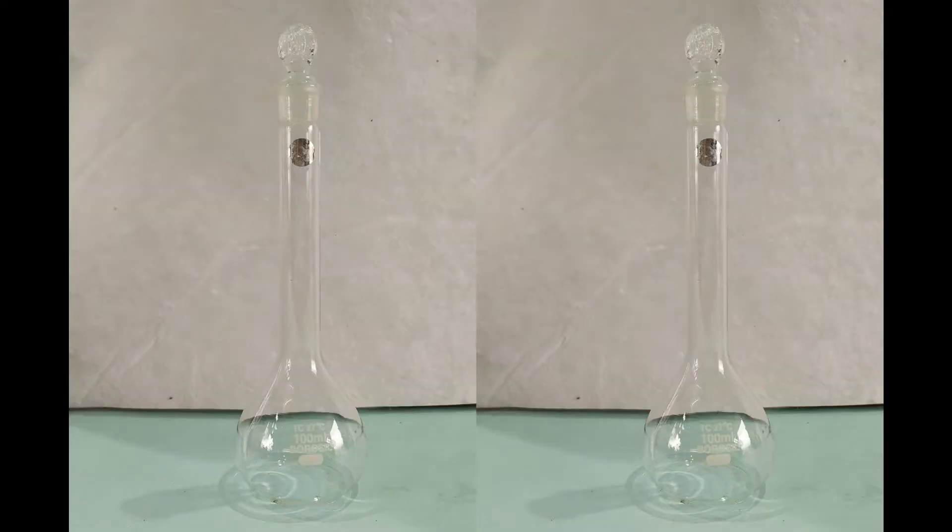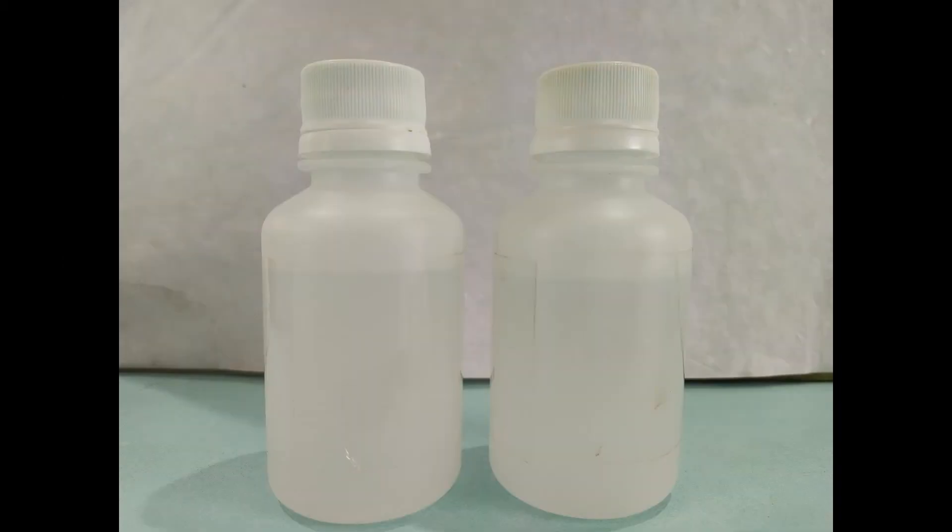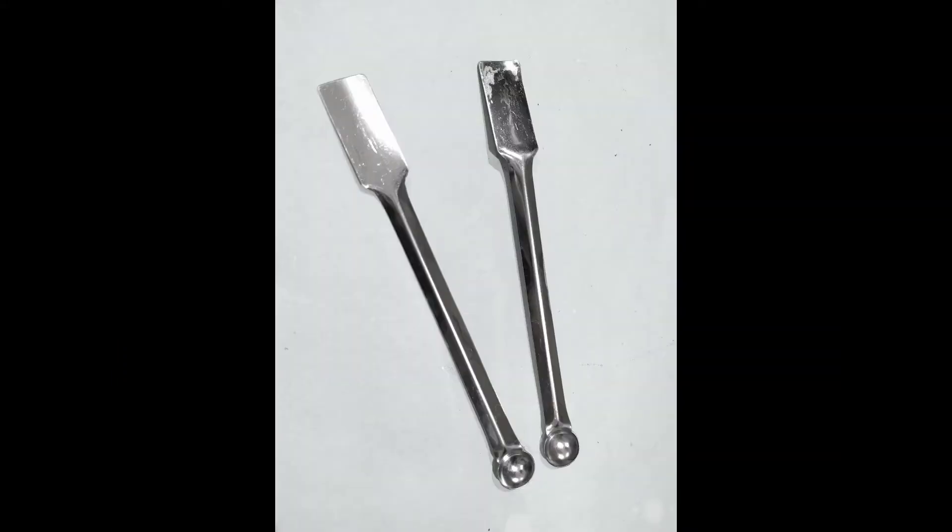You'll also need 2 volumetric flasks or measuring cylinders of 100 ml capacities, 2 small funnels, a dropper or pipette, 2 suitable containers for storing the reagents, 3 watch glasses, and spatulas.